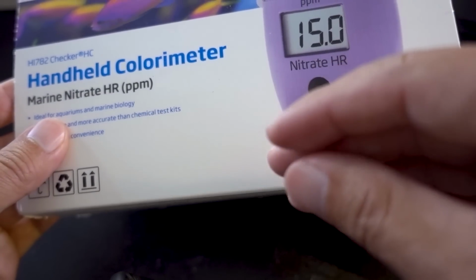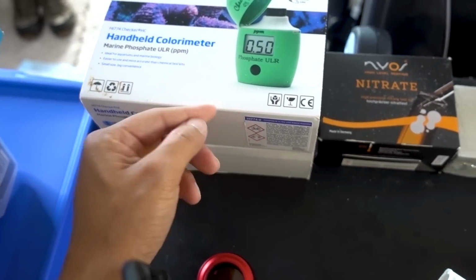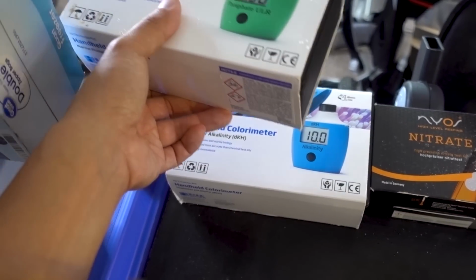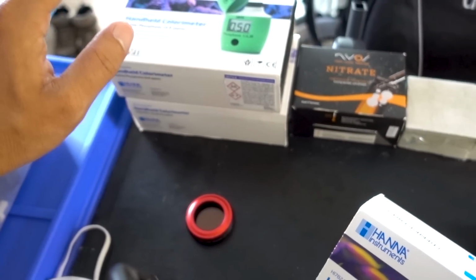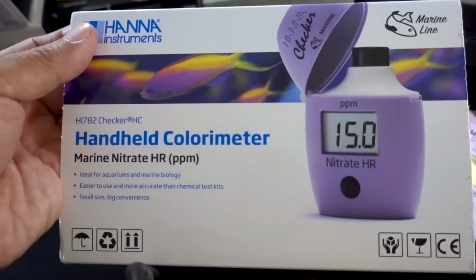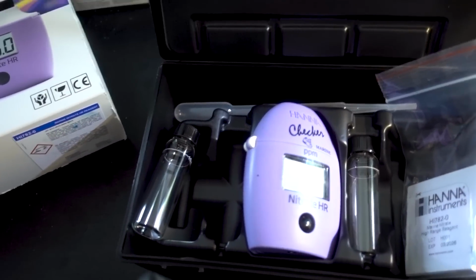There's something to be said about keeping things simple, because I feel like Hanna checkers' selling point is that number one, you get an accurate reading, and number two, it's really simple to do. My favorite Hanna checkers up to this point are the phosphate checker and the alkalinity checker. I think those two checkers knock it completely out of the park. The nitrate low range checker, while it's nice to get an accurate reading, it just takes too many steps. I ended up not using it as much as I thought I would.